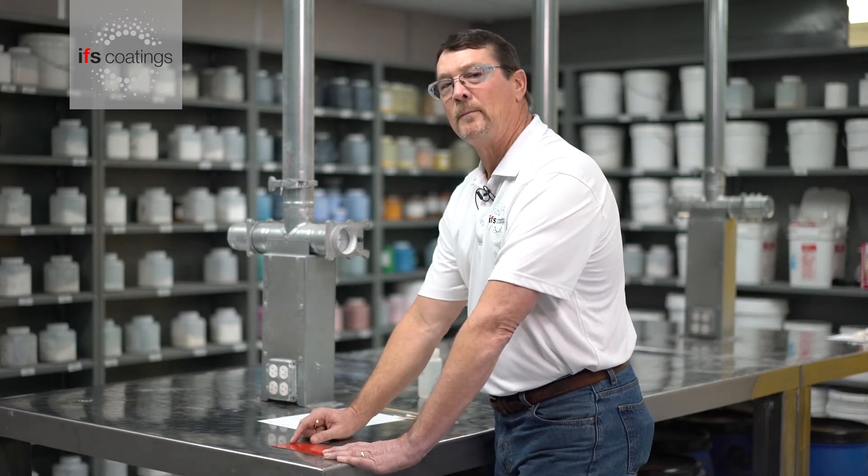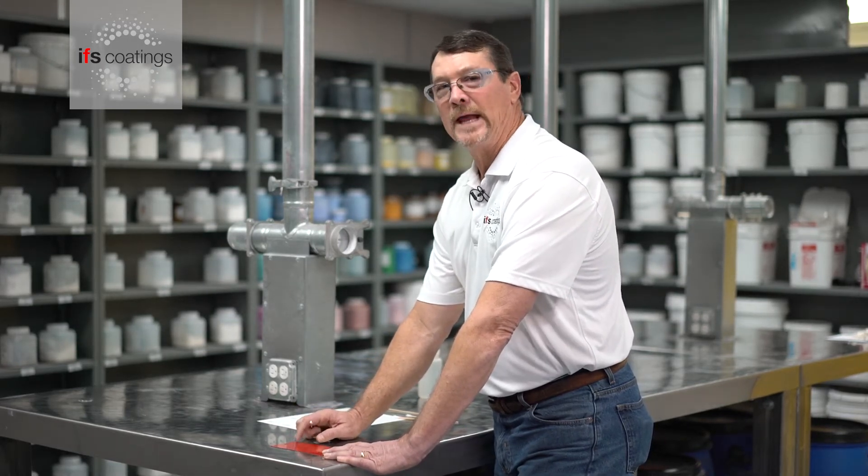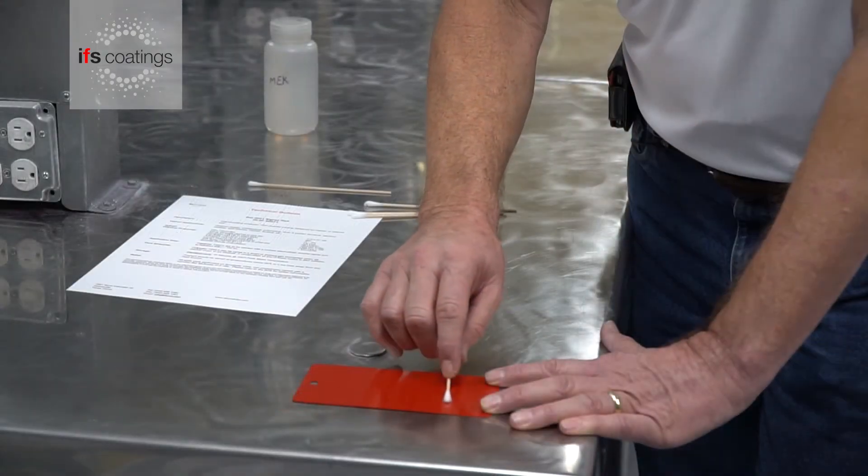So we know that we have a positive result on the application of this signal red. When doing an MEK test on a coated substrate, you have to remember that powder coatings produced at IFS are thermal sets. That means these parts have got to get up to a particular temperature and hold at that particular temperature to fully cure.